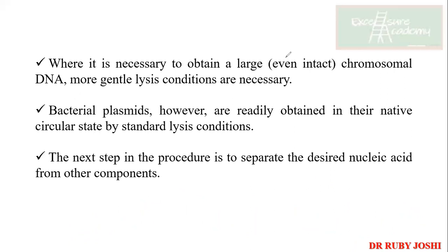See, that's what I'm saying. When we come to DNA purification, it is going to change because it depends on what you have added. We'll come to that. Right now, we are just doing the isolation of the stuff. We are not doing the purification.